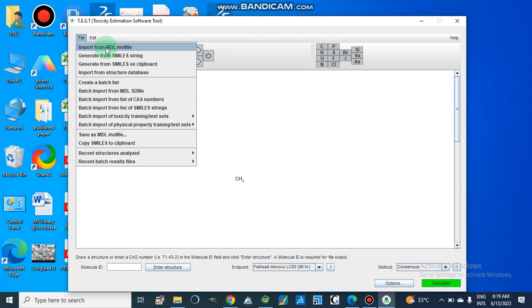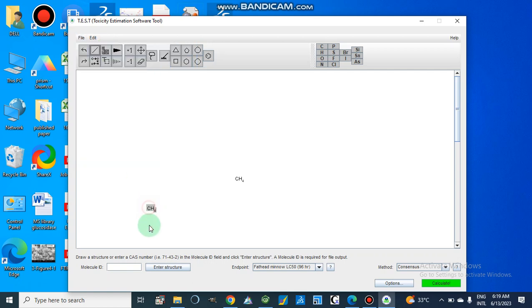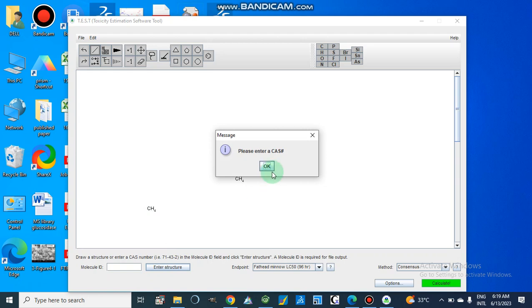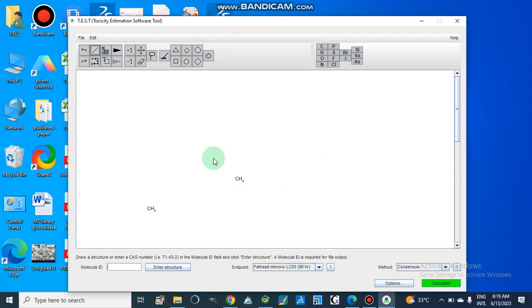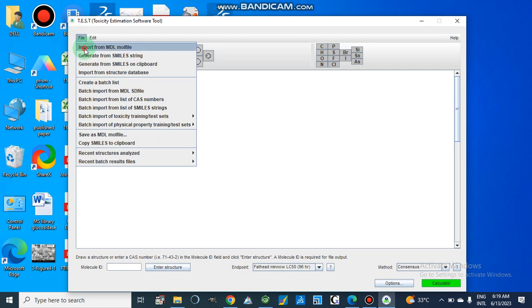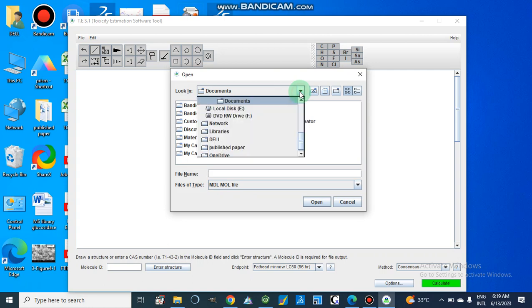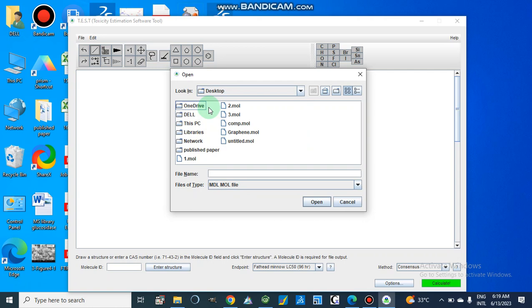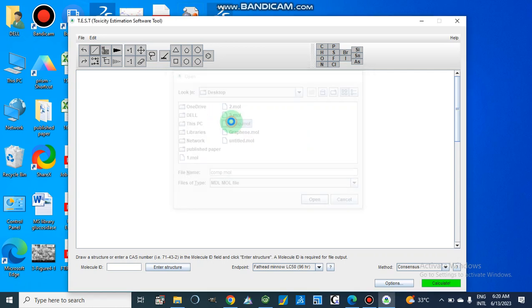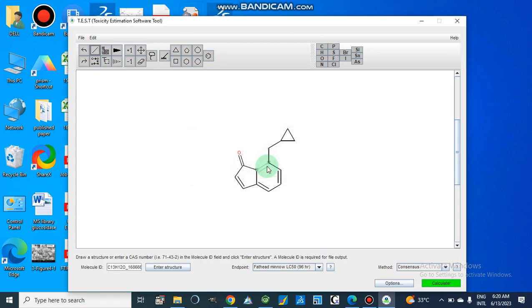Now it is saved. We move to the TEST software and from here we will import from the structure database, import an MDL mol file, or enter a CAS number. Here we will import from the MDL file. We go to the desktop and open the compound mol file. Now it is open and this is the molecular ID of this compound.